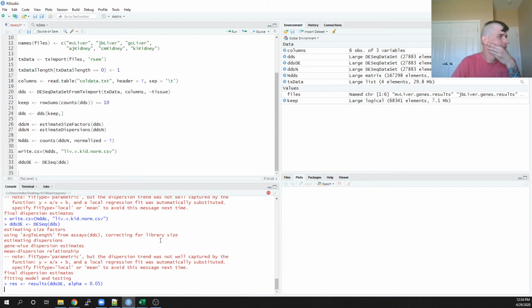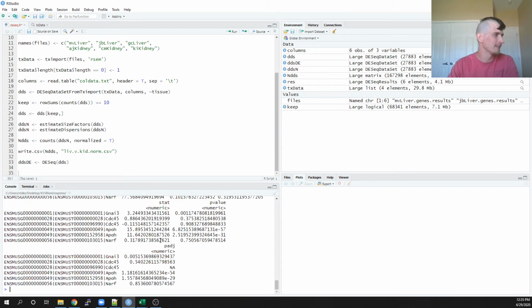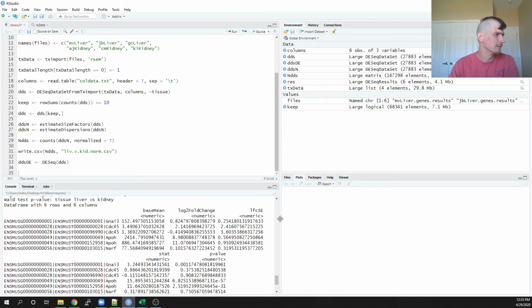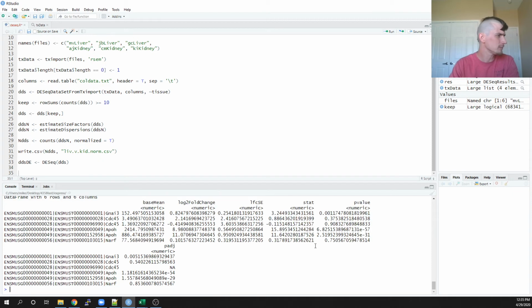So what's happening is this results variable will contain the results of every statistic test for every single row. So I'm going to head results just to give a sign. That's ugly. It's ugly as crap. Let's see if I can extend this over a little bit. Maybe I can get this all in one row.